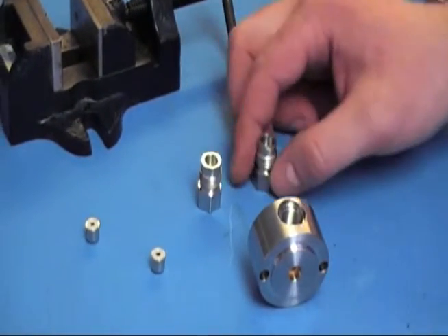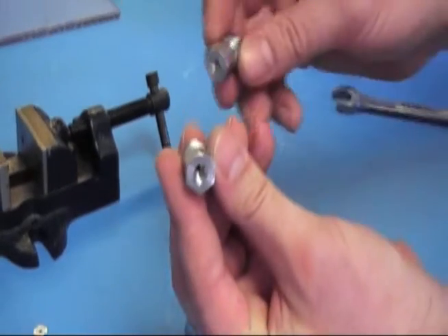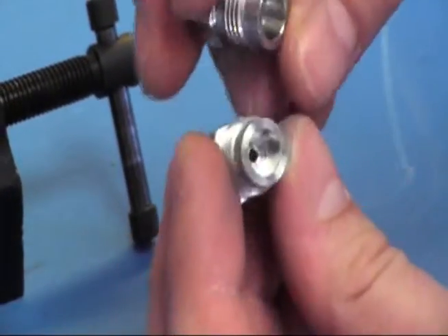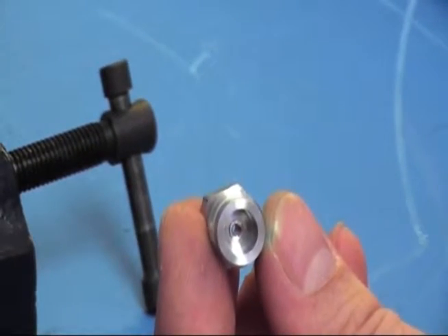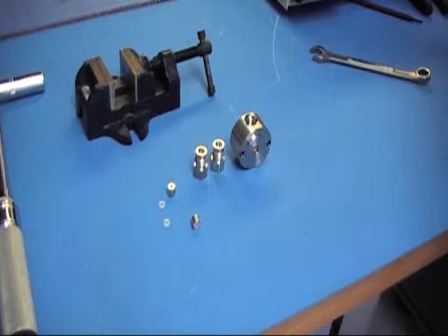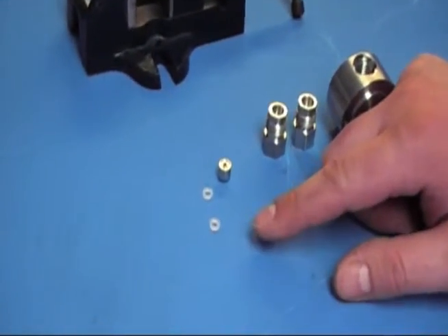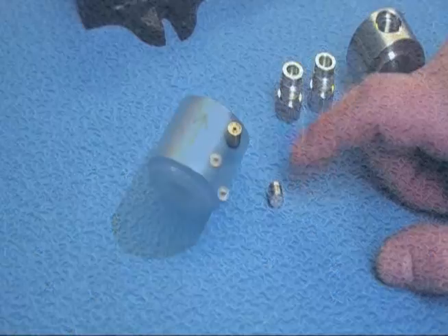And it's the same for the check valve housings. Once you have your flow orientation figured out for the head and the check valve housings, we'll go ahead and set up the check valves. Each of these check valves has an arrow stenciled to the side of them that defines the direction of flow, or the direction in which the fluid will flow through it.